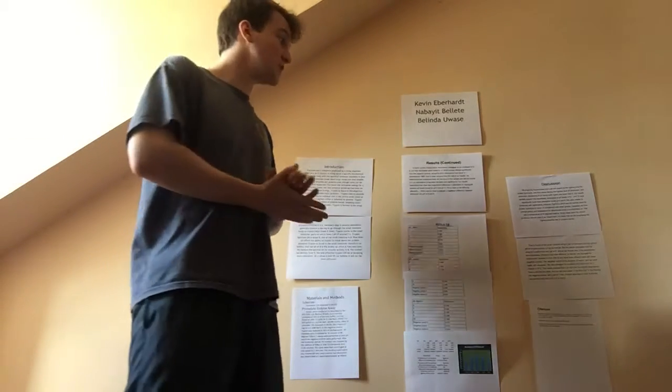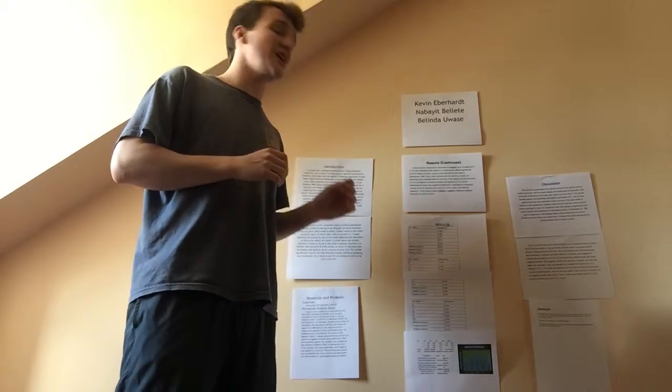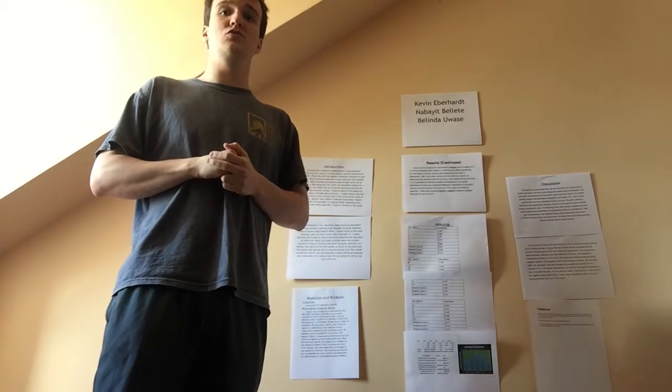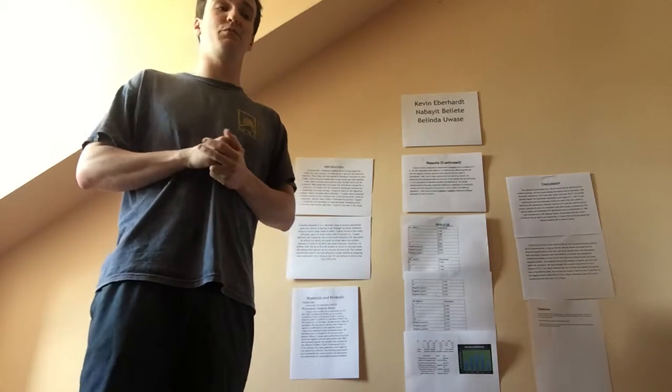So in conclusion, it appears as if pH 8 or 9 for us was the optimal level for trypsin to catalyze the hydrolysis of the protein.